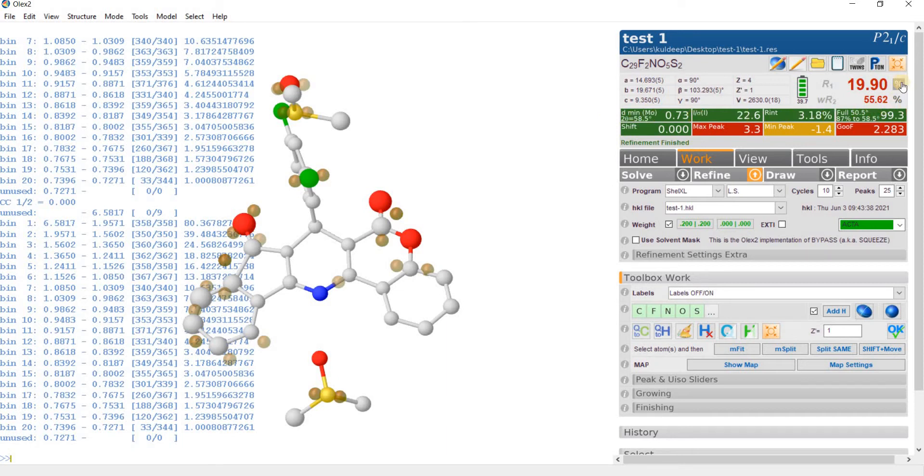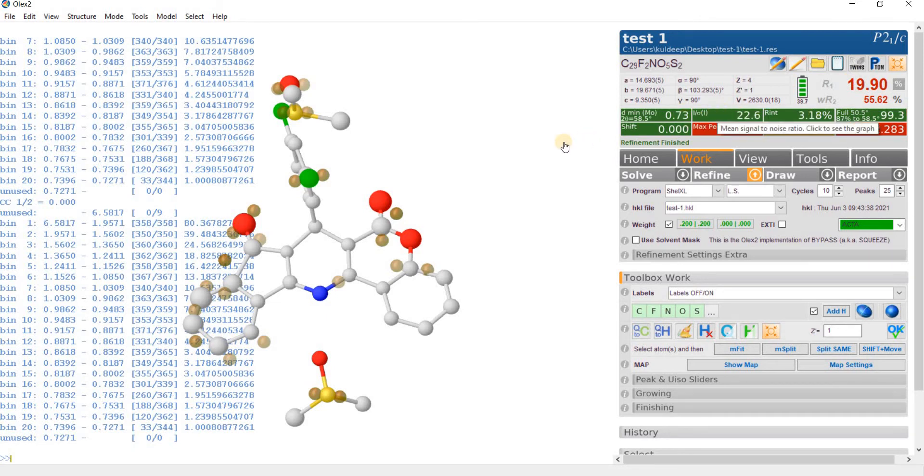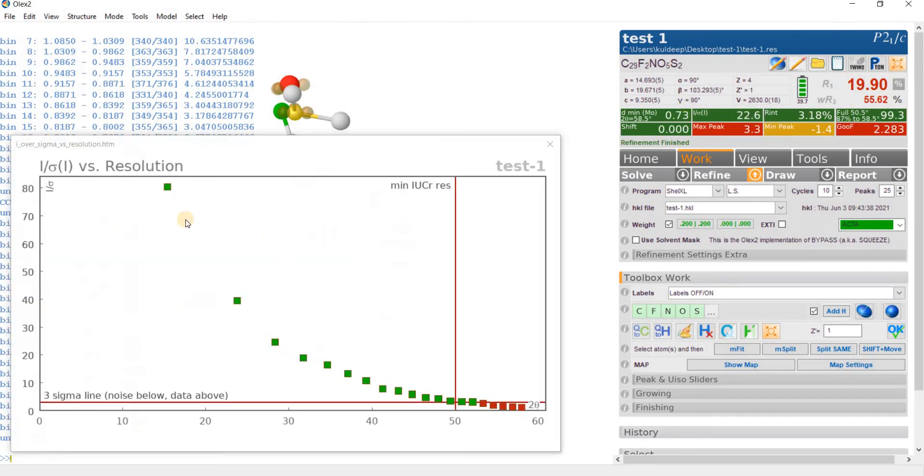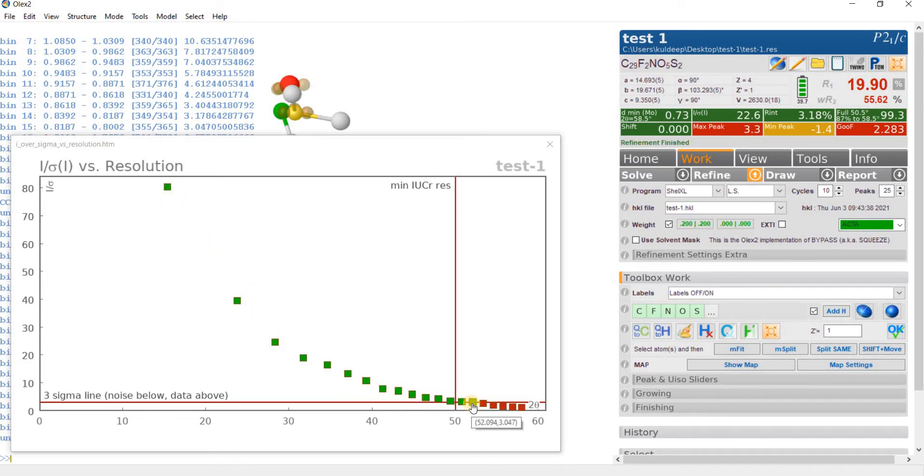The R factor is around 20%. If you look at the I upon sigma graph, the graph is very good and the crystal is of good quality and it diffracts up to 2 theta 52 degree.